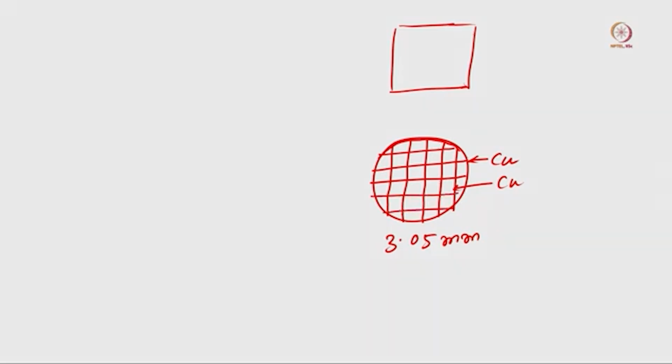Now if you look at one of these squares, there are uniformly sized holes inside that square, and these are the carbon area. If you look at one hole, how will it look from the side? From the side it will look like that. We have AFM data, atomic force microscope data, where this will be the carbon area, and this is literally a hole where the electron beam can go through if there is no sample.